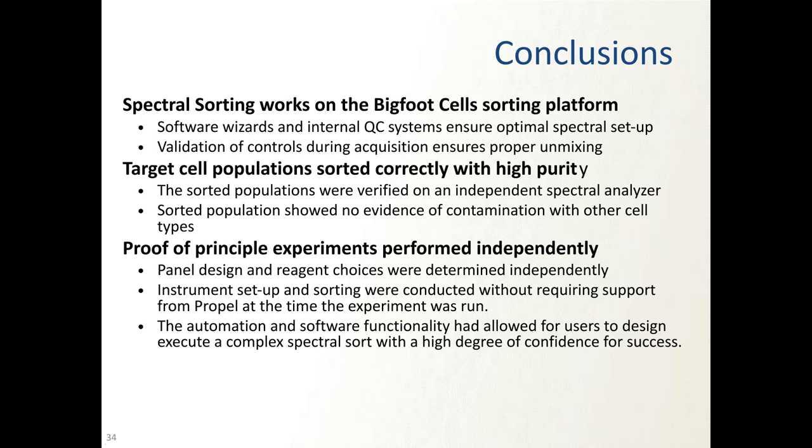And the automation of software has allowed users to make these experiments ahead of time and know that they have potential to work just by virtue of plugging in beforehand and assessing that. So right now, I'm sure this sorter works, and the workflow keeps you from painting yourself into the corner too badly.